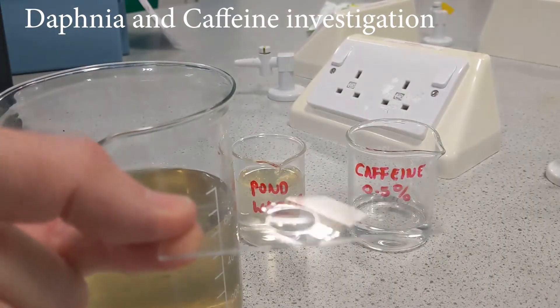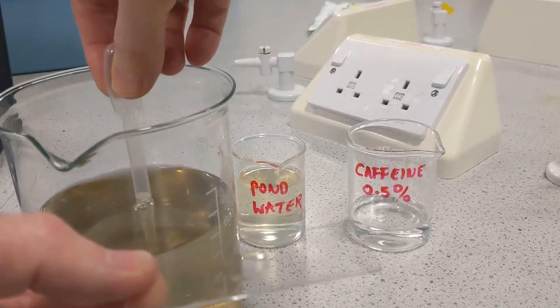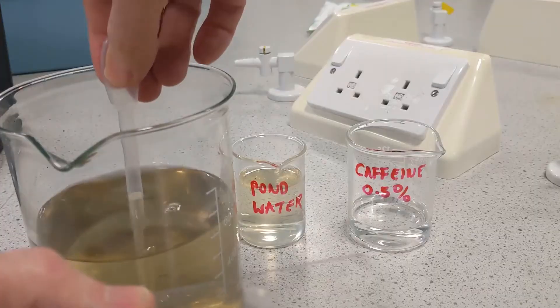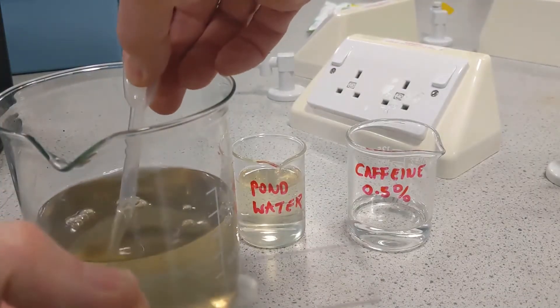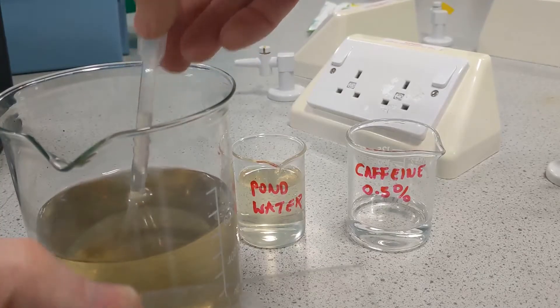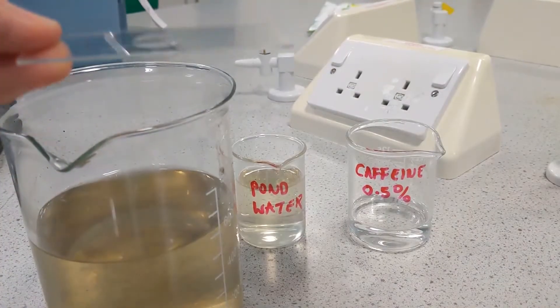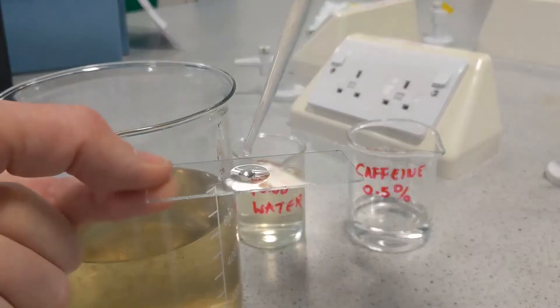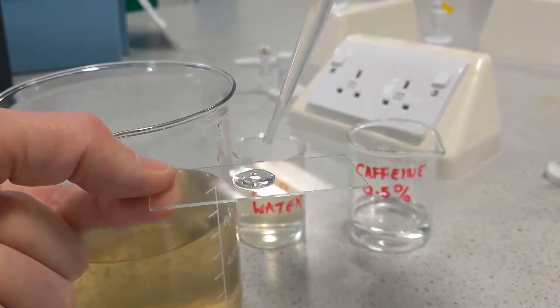Take a clean cavity slide and collect a few drops of the pond water with Daphnia in. I'm going to find Daphnia. And then when you've got a Daphnia, let him drop to the bottom of the Pasteur pipette and then just pop a few drops on until you get your Daphnia onto your slide.